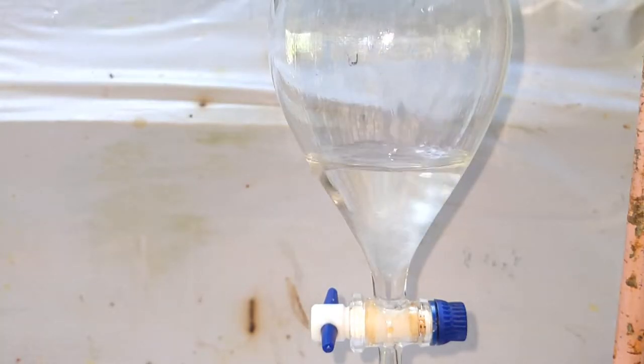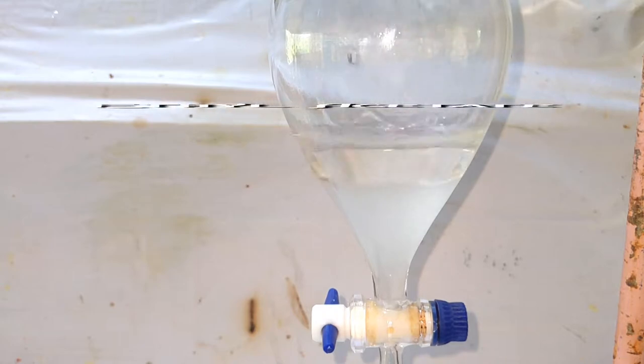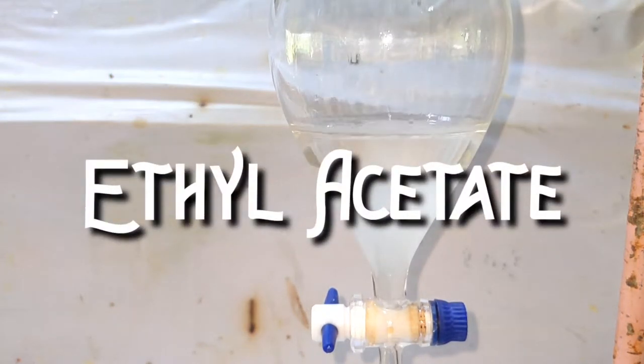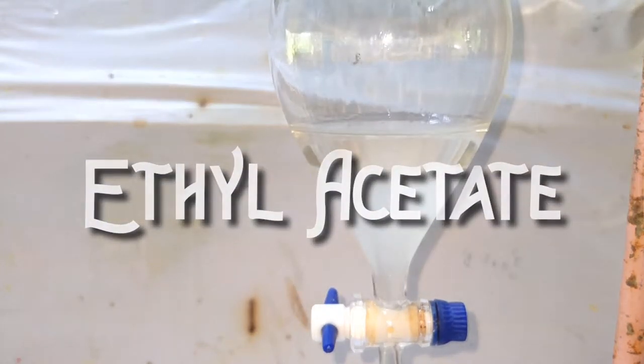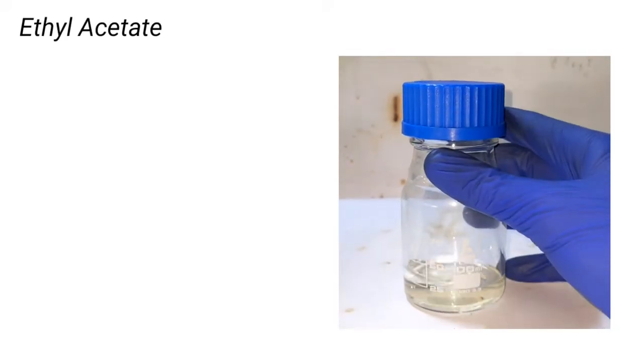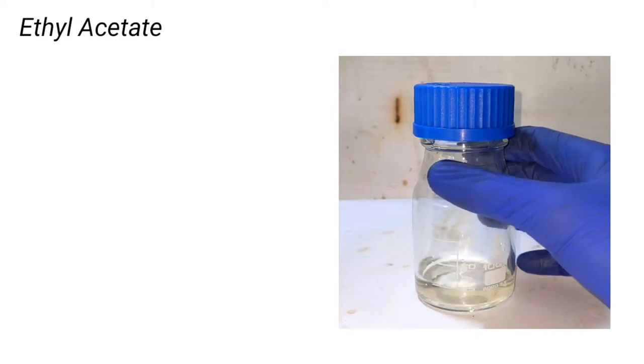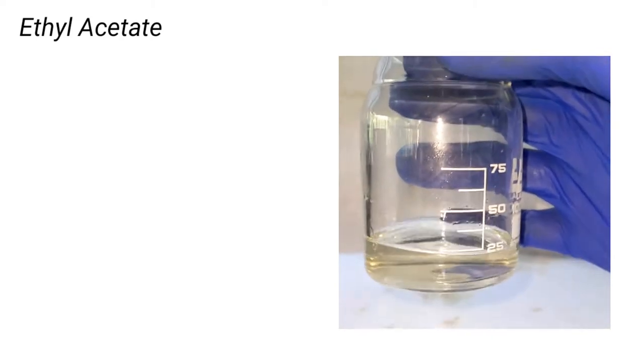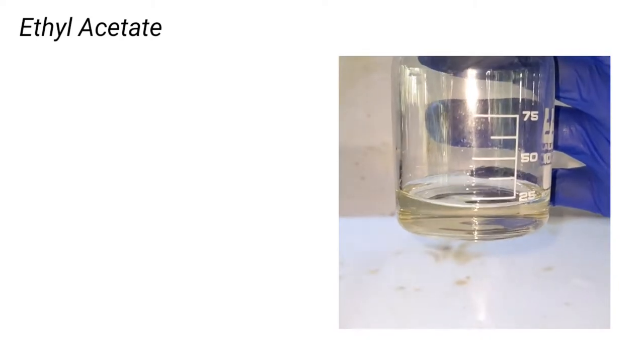Hello friends, in this video we will make ethyl acetate by the Fischer esterification reaction of acetic acid with ethyl alcohol. Ethyl acetate, or ethyl ethanoate, is an ester of acetic acid with ethyl alcohol. It is a colorless, clear solution which is highly volatile.